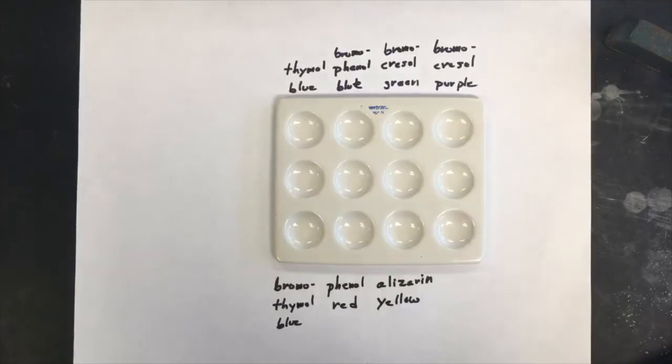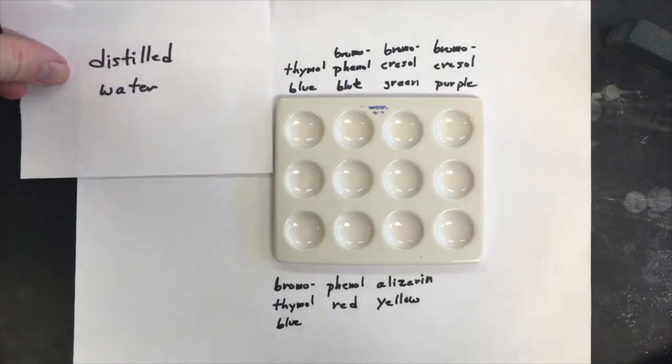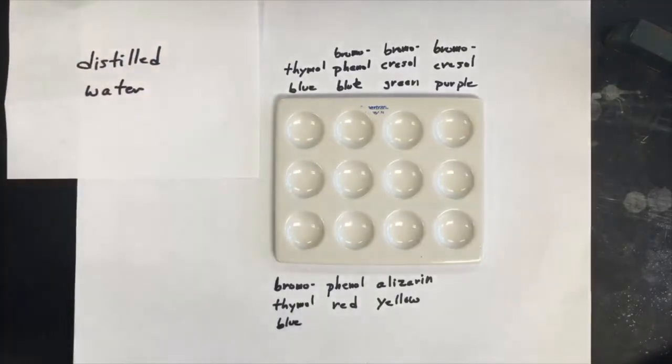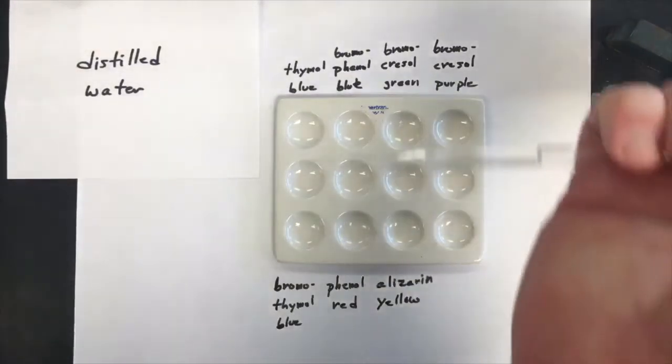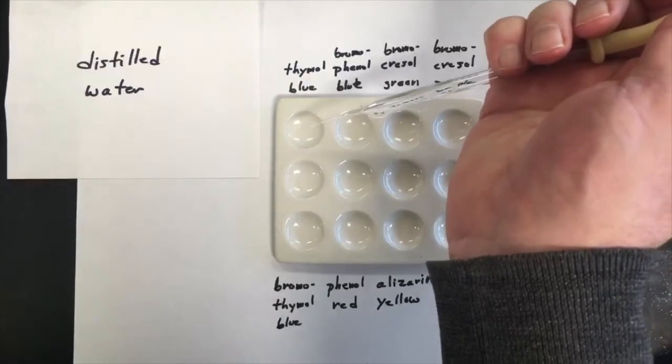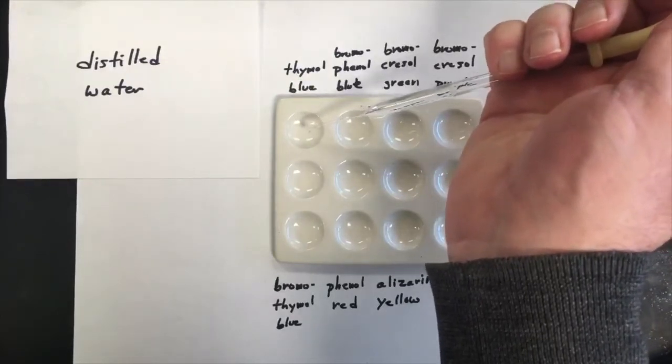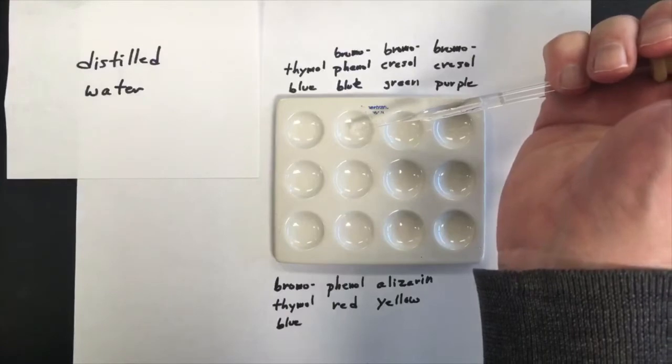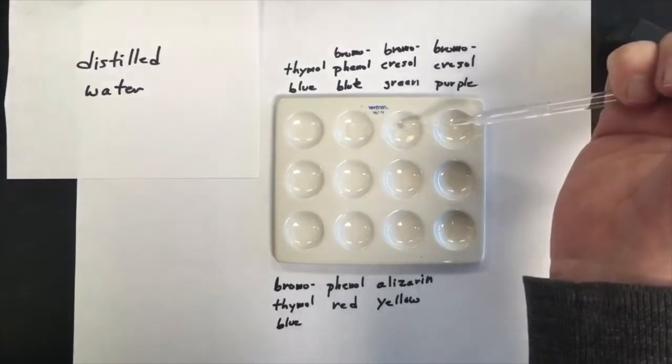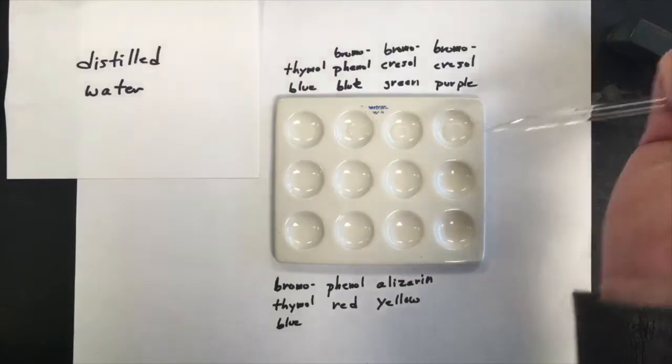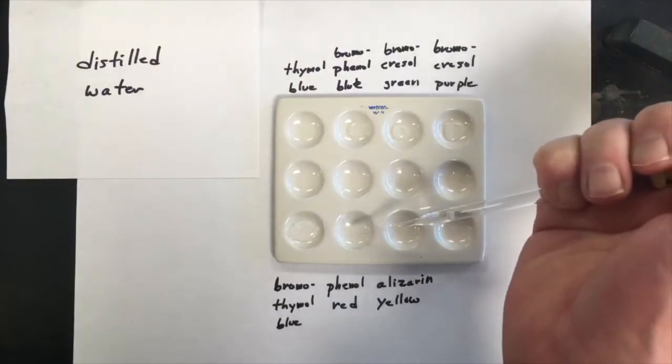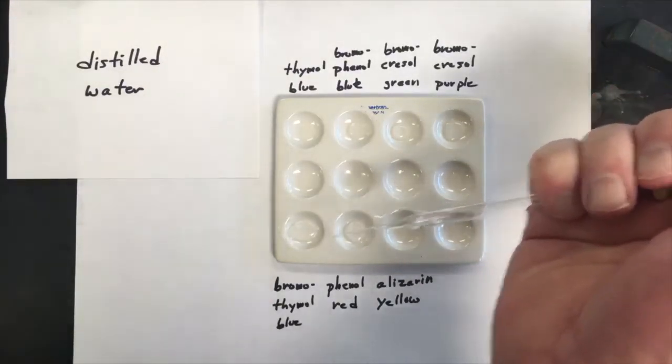So, now I'll just show you the general procedure for how I'm going to do this. For the first sample being tested is distilled water. I'll put a little piece of paper here, remind us it's distilled water. I'm going to put three or four drops of distilled water into each of the seven wells. So that's plenty.